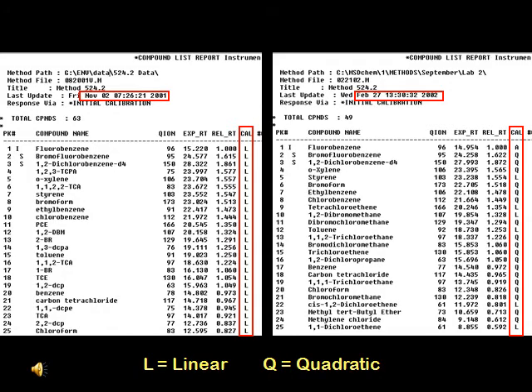Now we will bring this discussion back to the topic of this section, which is the inappropriate use of calibration models to compensate for not performing maintenance. Obviously, the lab was experiencing severe problems with this GC mass spec instrument, which required maintenance. However, the analysts admitted to ADHS that they did not know what the problem was with the instrument. One of the actions that the analysts used to pass the method required calibration and quality control criteria, despite the instrument problems, was by flipping the calibration model from linear to quadratic.